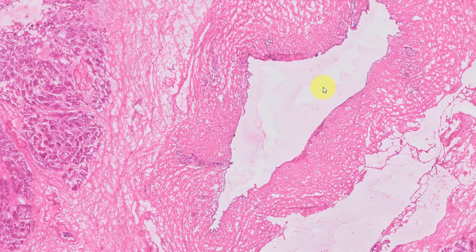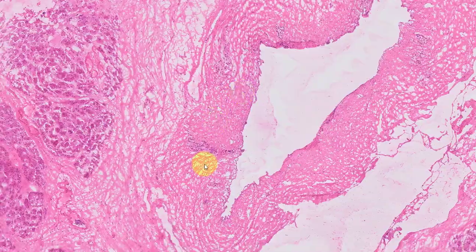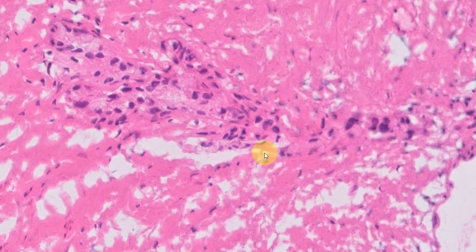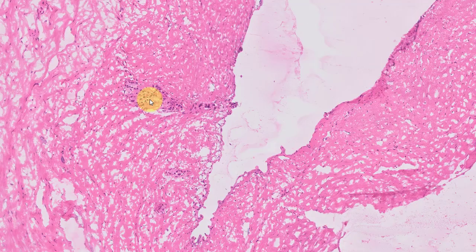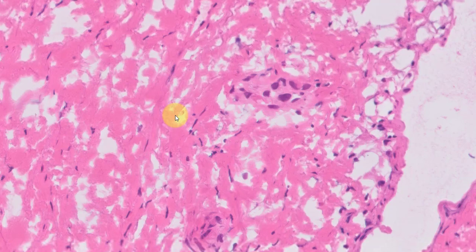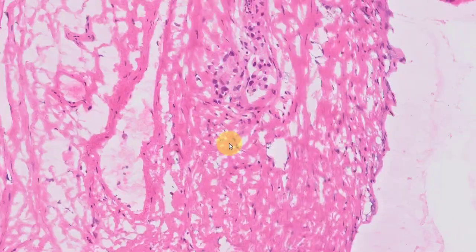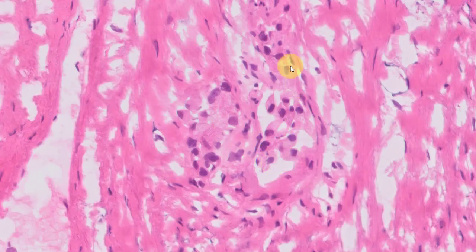Now, this is the main pancreatic duct, and I know that because it has a very thick sheet of fibrous wall surrounding it. The question was, what do you think of these ducts? Touch fuzzy, they looked rather monotonous, but the person was very worried because there were several of them. Here's another, and then as you go along, you start seeing these ducts.